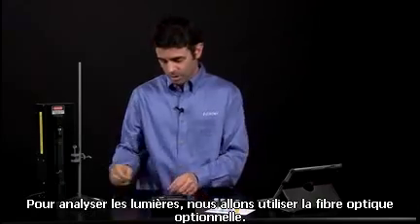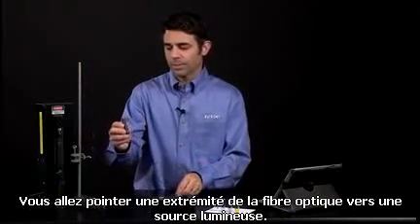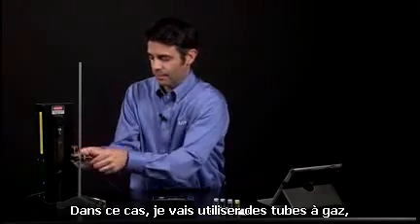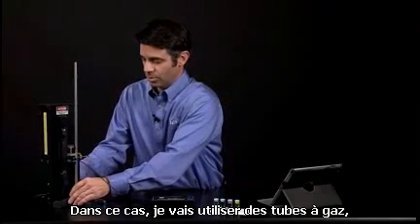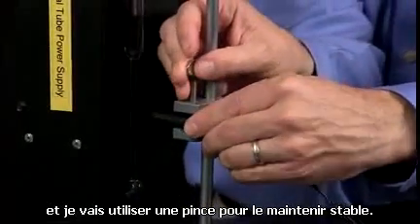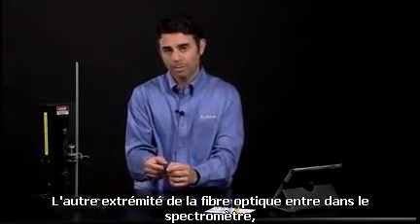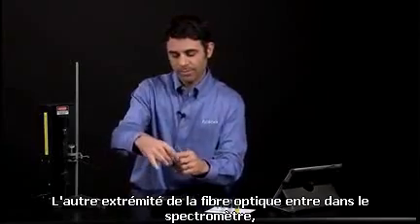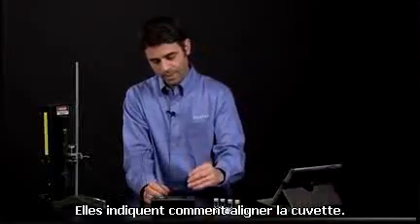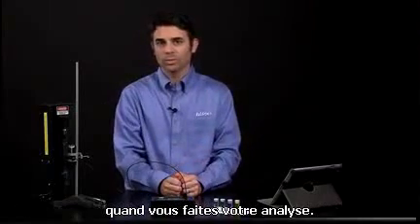To analyze lights, we're going to use the optional fiber optic accessory. One end of the fiber optic accessory you're going to point at a light source — in this case, I'm going to use some gas emission discharge tubes. I'm going to use a clamp to hold it steady. The other end of the fiber optic accessory goes into the spectrometer. The arrows point towards the detector, which tells you how to line up the cuvette. It's a very snug fit so that it doesn't wobble around during your analysis.